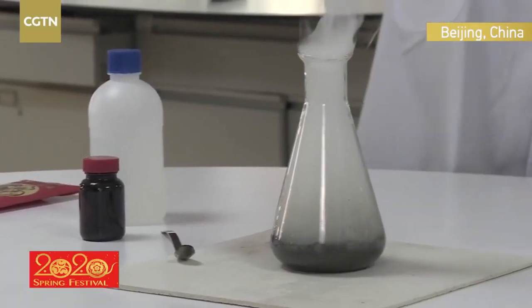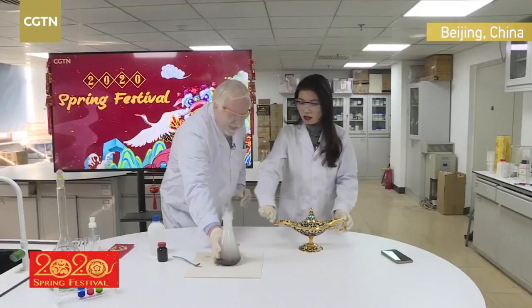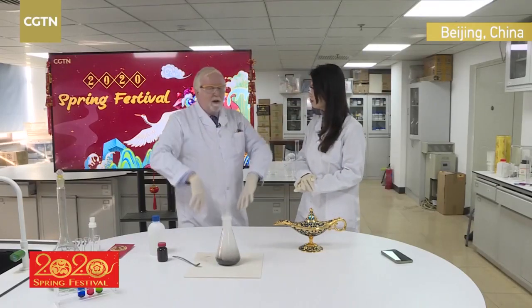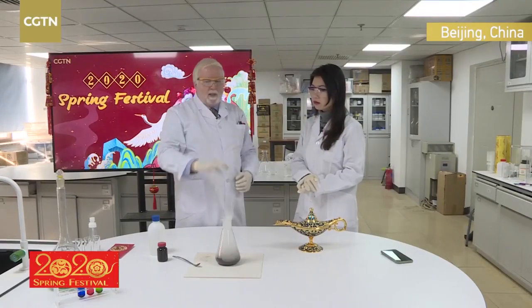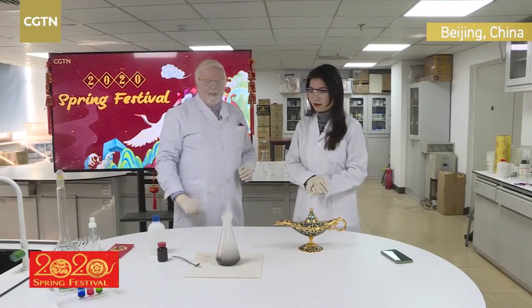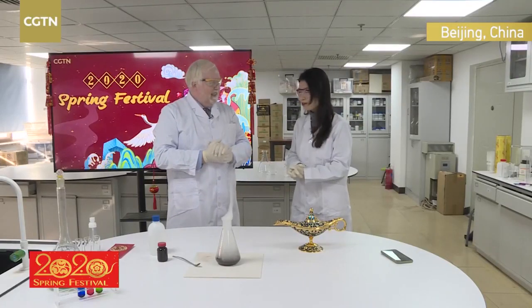So it creates a lot of oxygen, but it's also an exothermic reaction. It gives out heat. So as well as the oxygen, which of course you can't see, you're getting a lot of steam. The steam comes into the air and condenses to make water droplets. So what we're seeing, like the genie from Aladdin's lamp, is actually steam coming into the cold air. Wow, I feel like something I learned in high school really turns into reality.